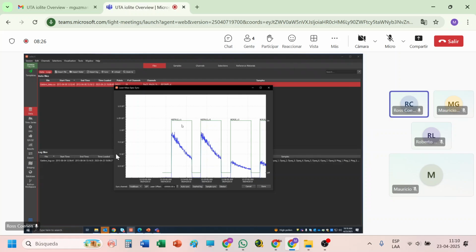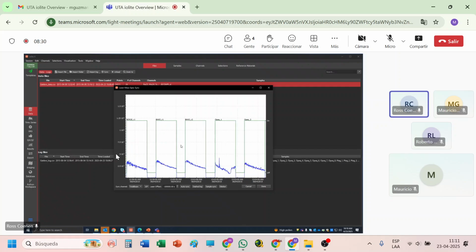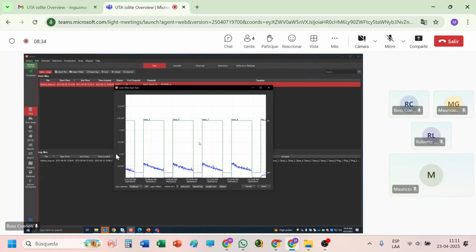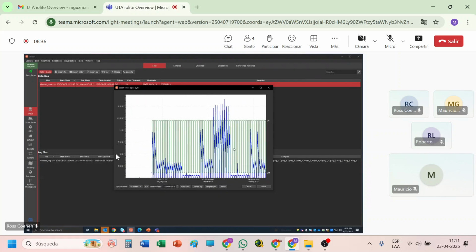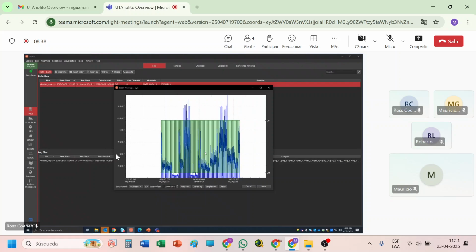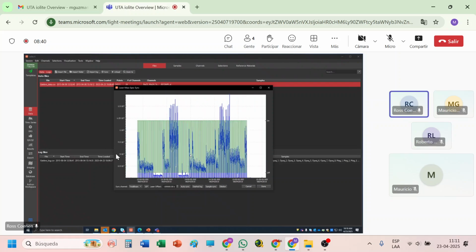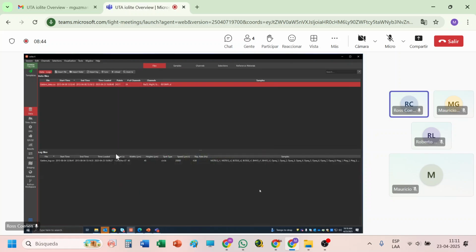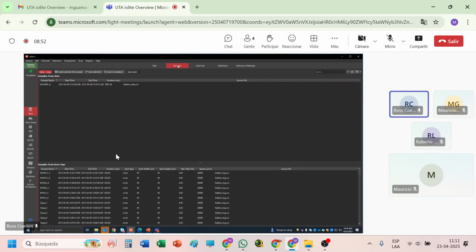The beginning here, you can see is NIST 612 glass, BCR. These are the different sample types. So once this is all aligned, hit done. And after that, we're going to move next to samples.